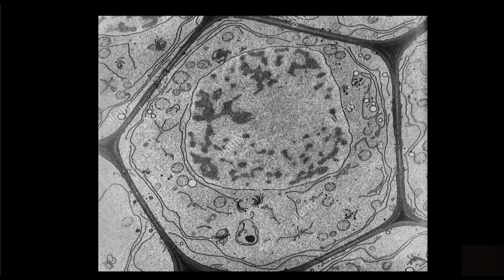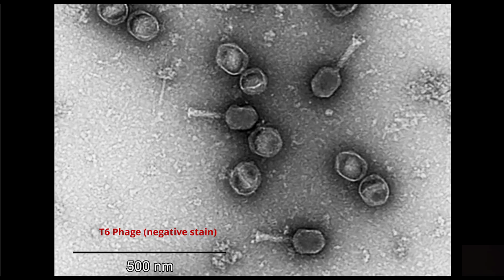I told you that we cut with a diamond knife, and you know if you have a good prep if you don't see any cut marks or striations throughout, introduced when you made the cut with the diamond knife. So if there are no imperfections, then that's really nice, and whoever did this, that's beautiful. That is just amazing. Here's the T6 phage.